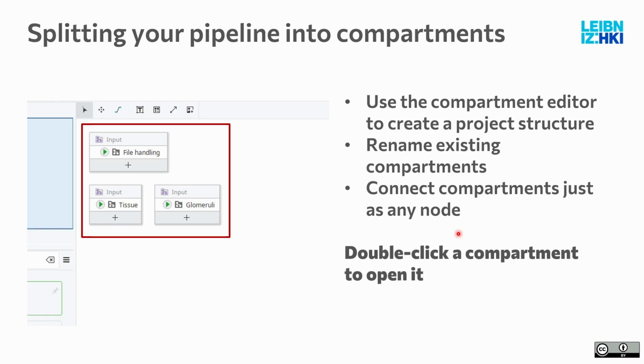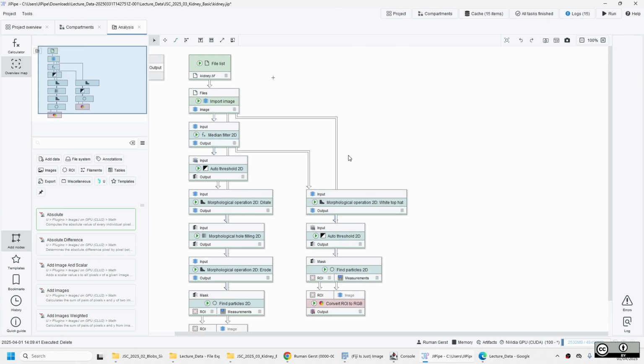Let's structure our project. So we are at this current state. We have some basic structure here already, but you can imagine if this is a larger pipeline, at some point this will be super, super large.